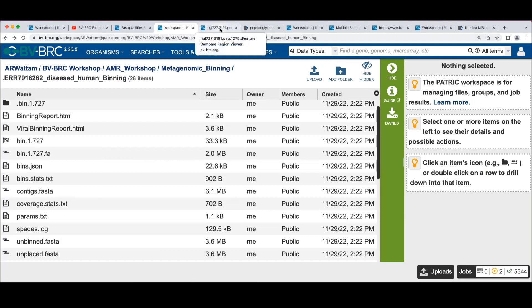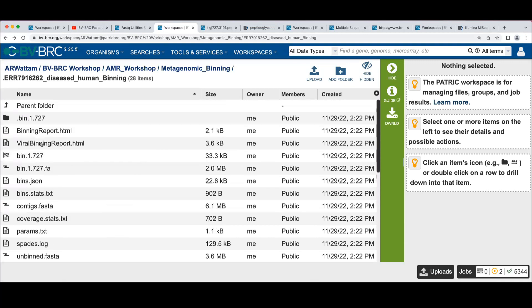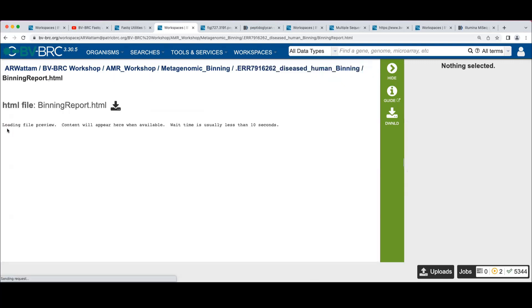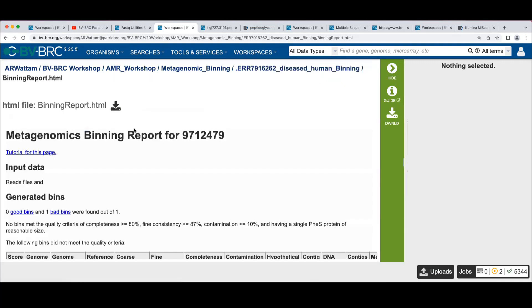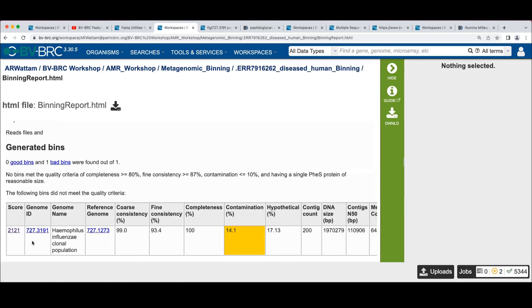Does that have a genome ID? It does. So if you go back to our binning report, that's the second thing on the line here is the genome ID that was assigned for this genome.